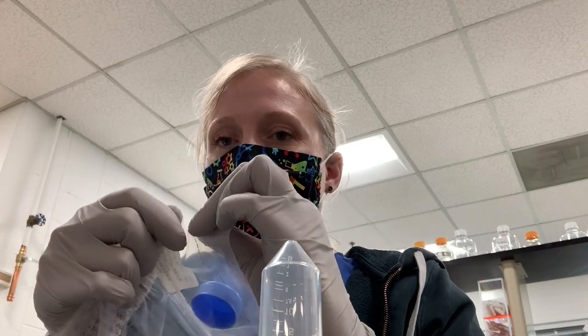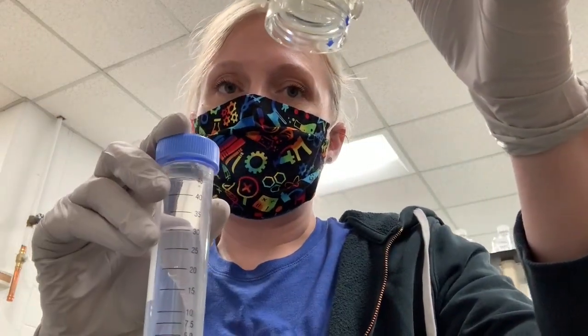I'm going to be very careful when I open this. I'm going to pull out the lid without touching the inside of it. And I'm going to screw off the filtration system and add the cap. So this is now my 5 molar solution of ammonium acetate, and it is sterile. So I'll label it and then it'll be ready to use.